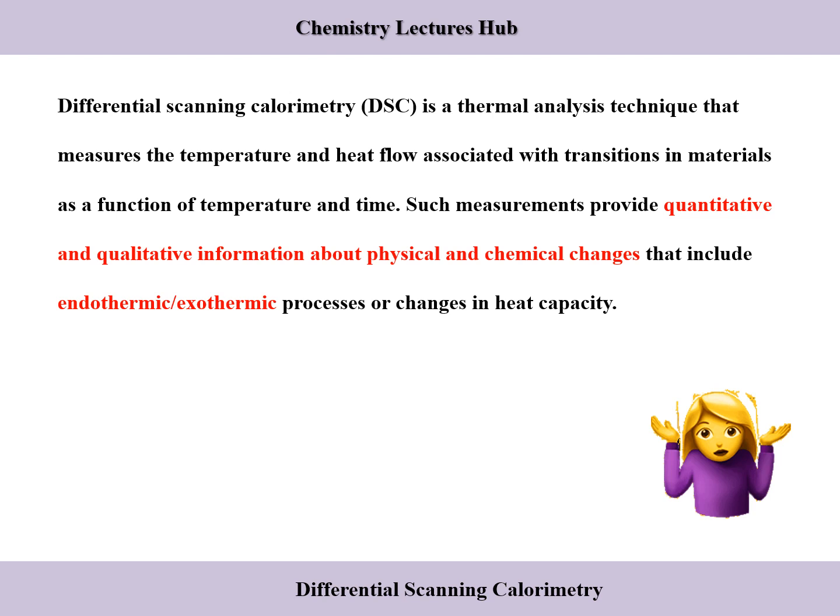Exothermic processes release heat while endothermic reactions absorb heat. Examples of exothermic reactions are crystallization, curing, and oxidation, whereas examples of endothermic reactions are dissolution, melting, glass transition, and decomposition.